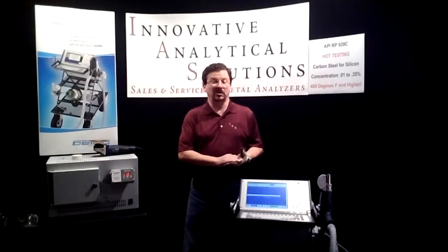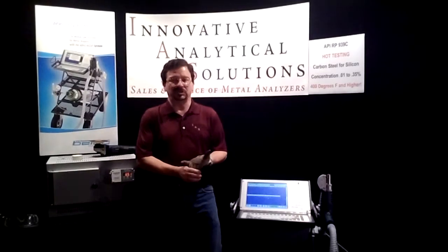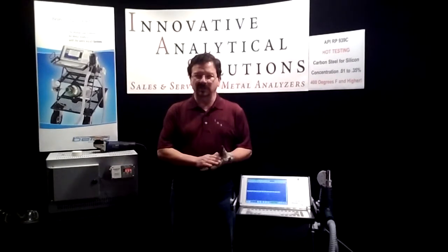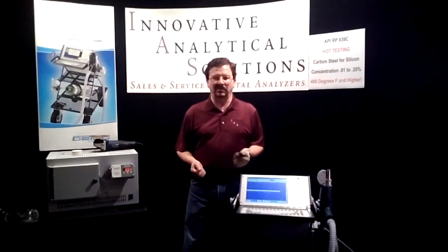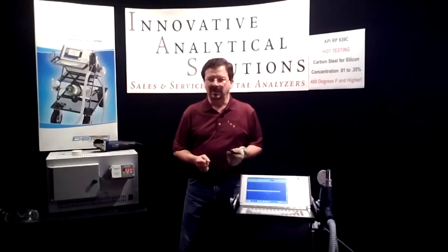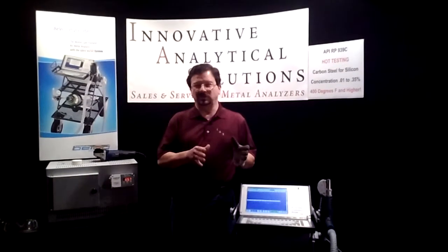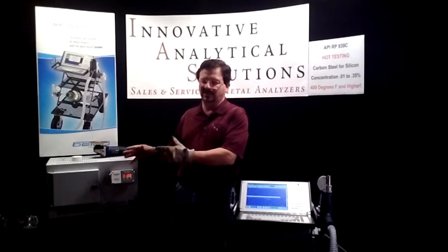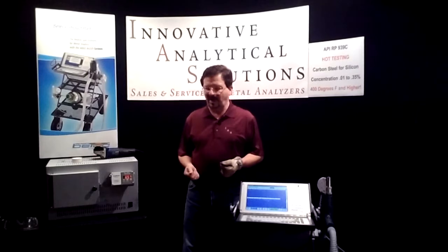And these are refinery steels running at hot temperatures in excess of 400 degrees Fahrenheit. There's 3 types of steels that these guys can encounter. One is called a rim steel, where the steel has a silicon concentration of 0 to 0.1%. Silicon is considered an incidental element in that particular alloy. The second type of steel would be a semi-killed silicon steel, where the concentration runs from 0.10 to 0.20%, and then you have a completely silicon killed steel, which has a silicon concentration of 0.15 to 0.35%.